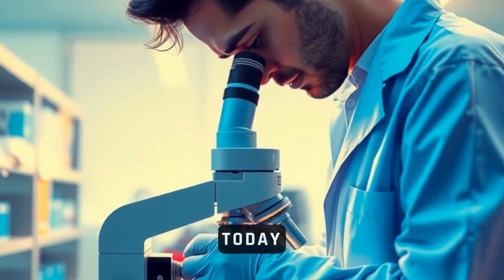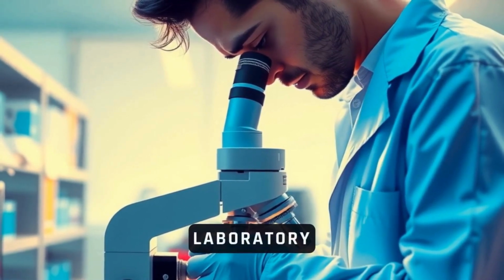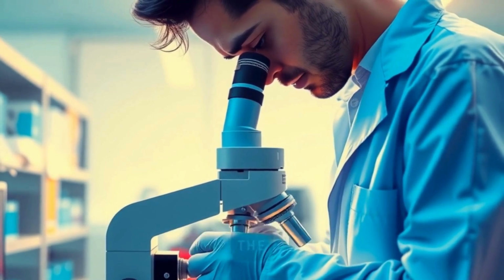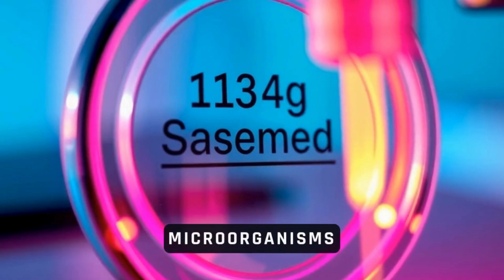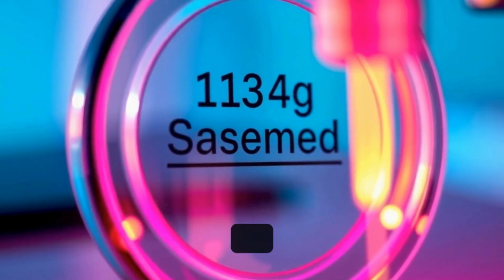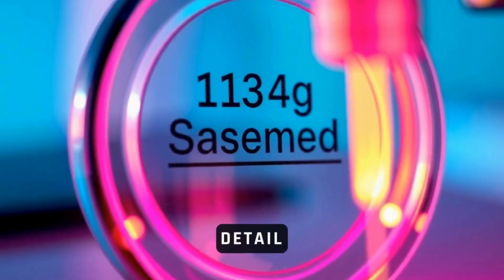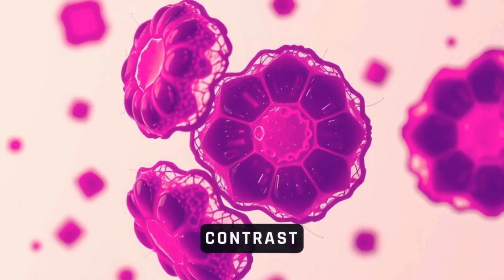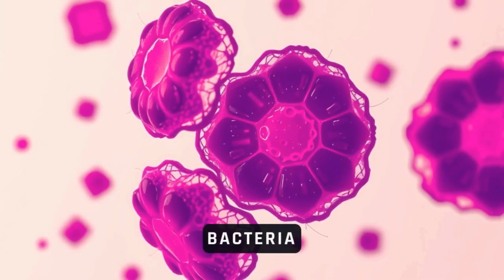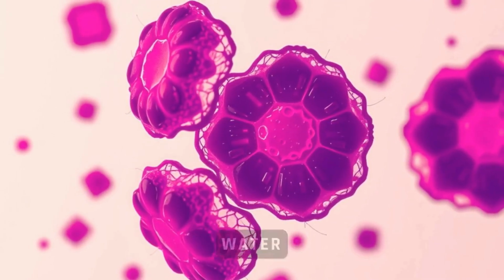Hello everyone. Today we discuss staining techniques in microbiology, a core laboratory concept that helps us visualize tiny microorganisms under the microscope. Microorganisms like bacteria are extremely small and often hard to see. Staining lets us make them visible and study their structures in detail. Staining enhances contrast in microscopic images. Without stain, many bacteria appear transparent because their refractive index closely matches water.